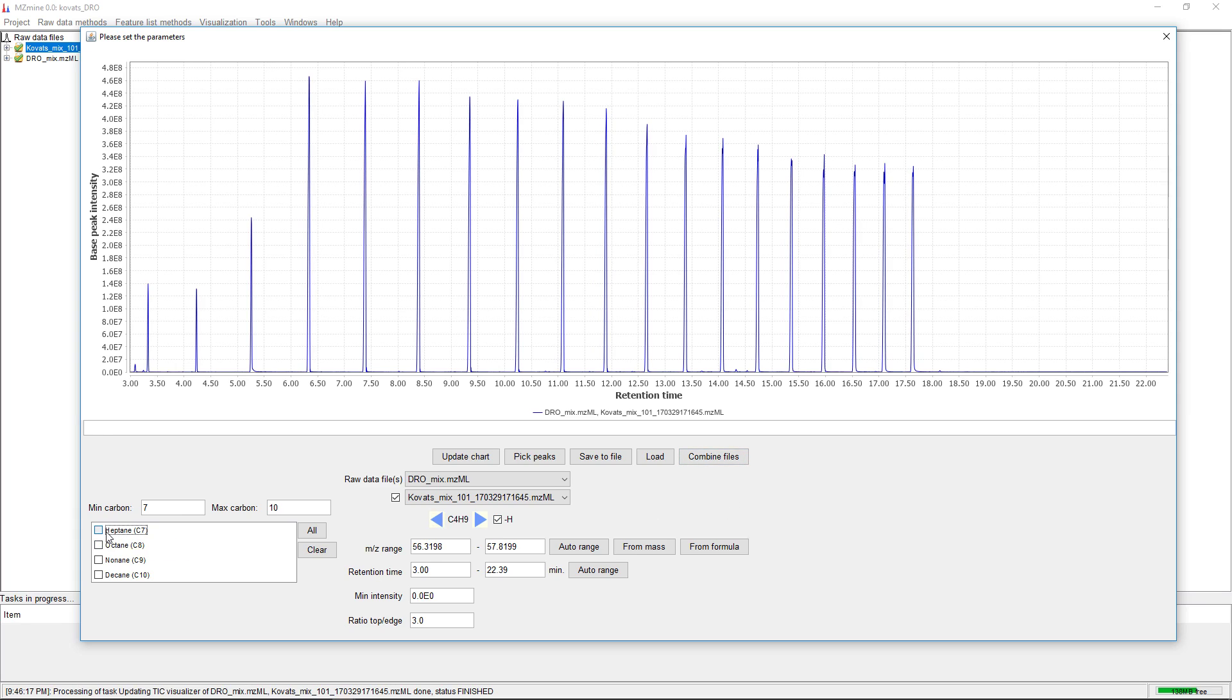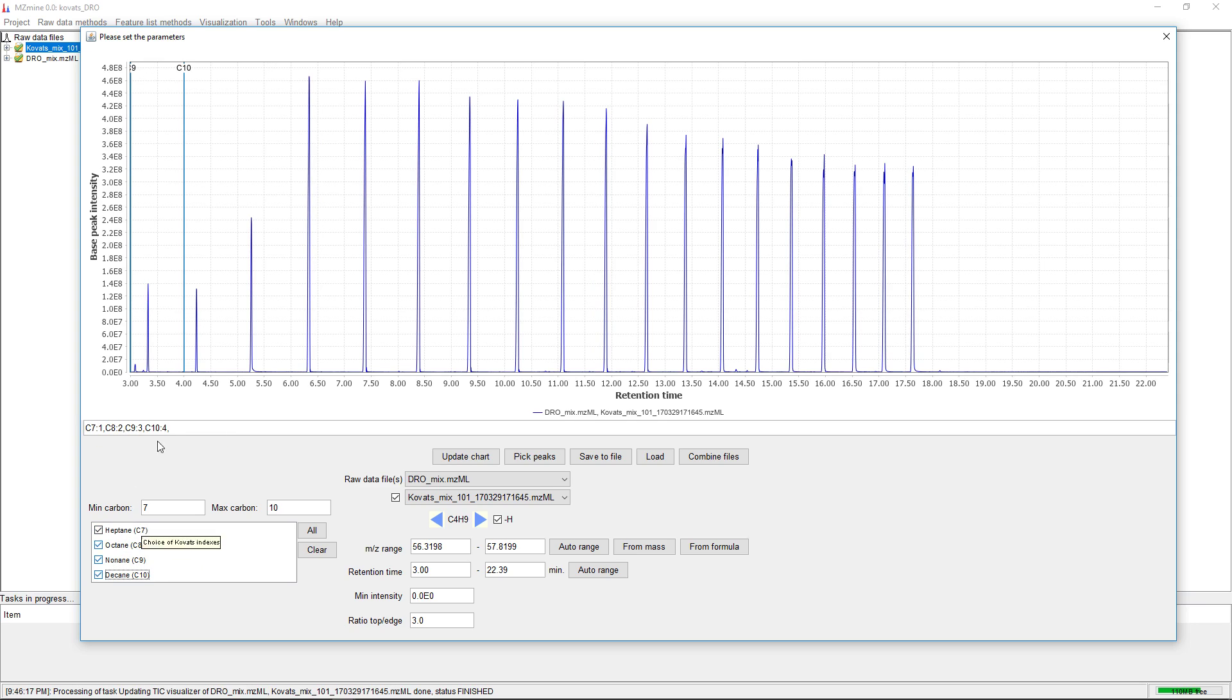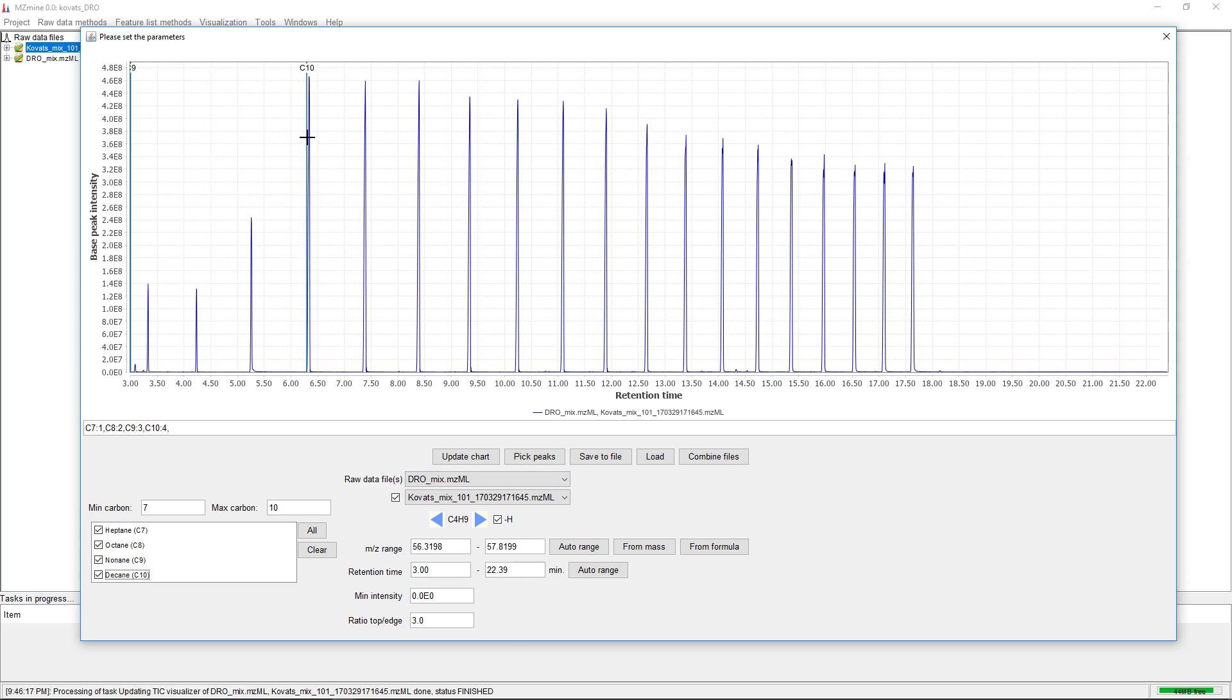Then we can start to add different standards here. The standards are just put anywhere in the beginning. We could click on them and drag them somewhere.